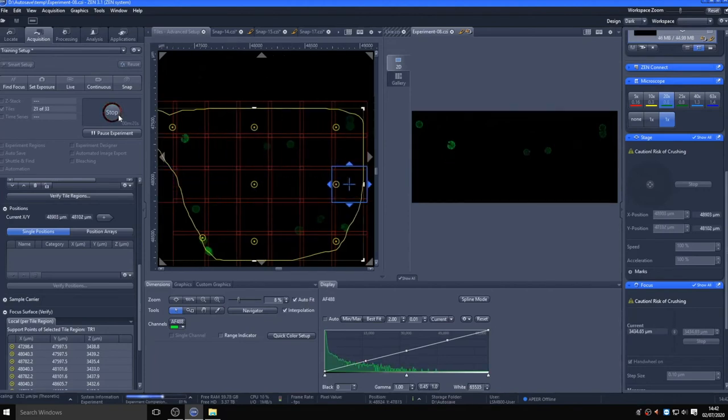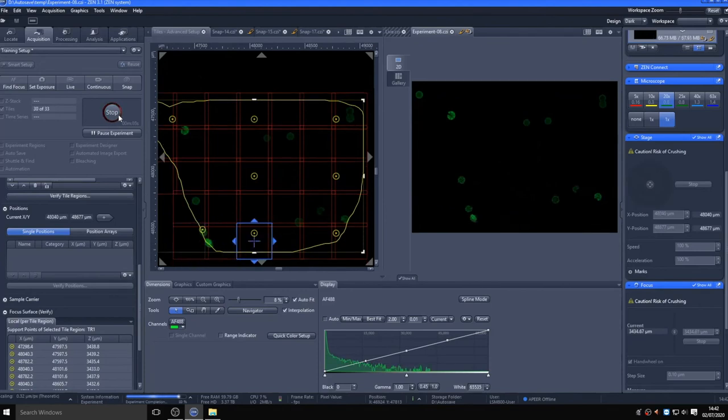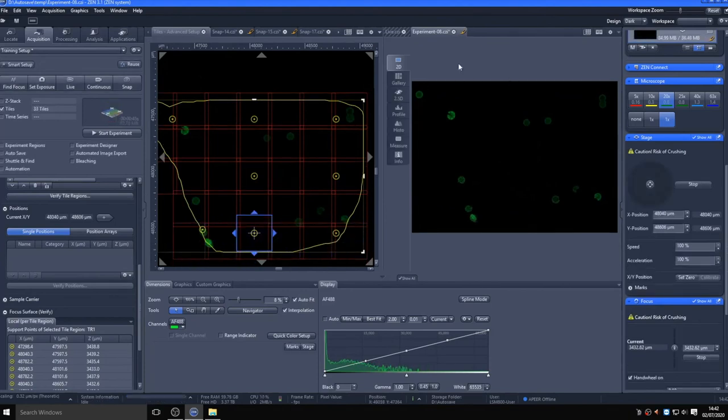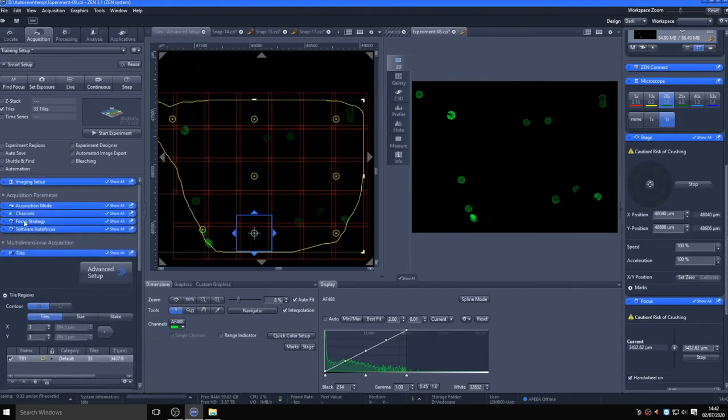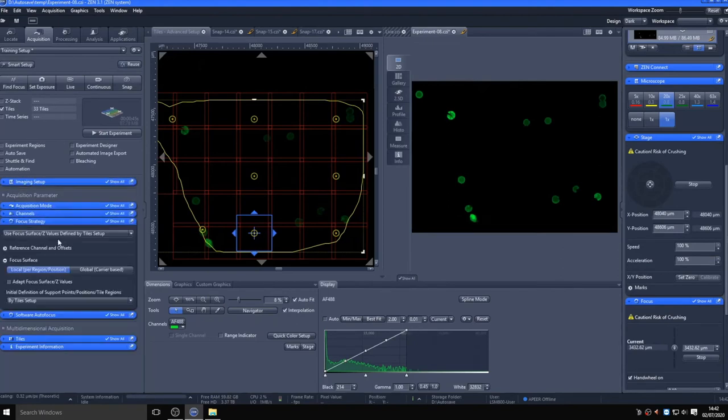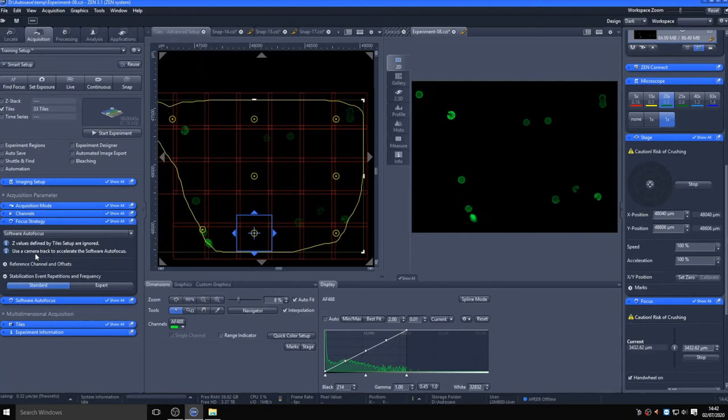There are other methods of carrying out focus mapping, such as software autofocus, which will search for the highest-contrasted position within the set Z range and use that as the focal plane. This would be limited in this case, as it would have difficulty on regions where there is no sample and therefore nothing to focus on.